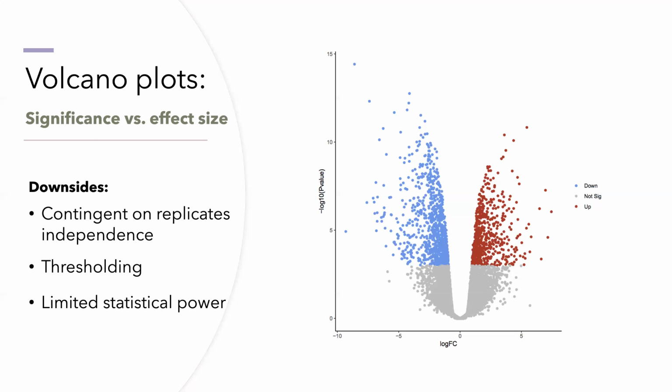We did not have enough replicates. We did not have enough peptides detected from these proteins. But nonetheless, there can be other methods that can identify their differential abundance that don't require even the computation of p-values for individual proteins.